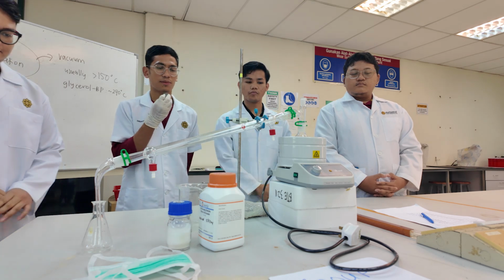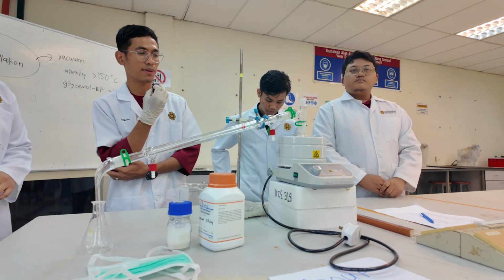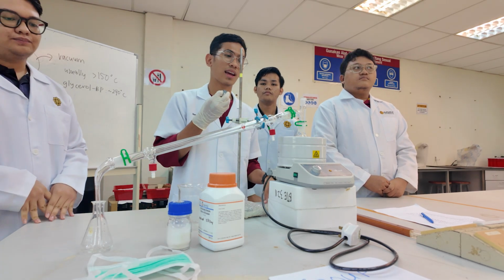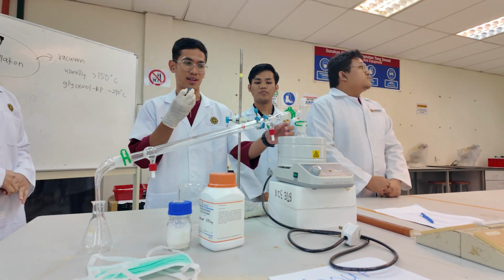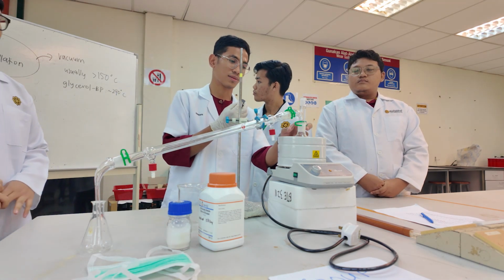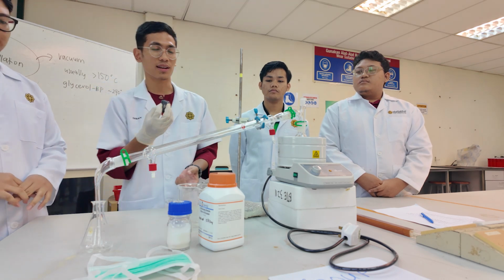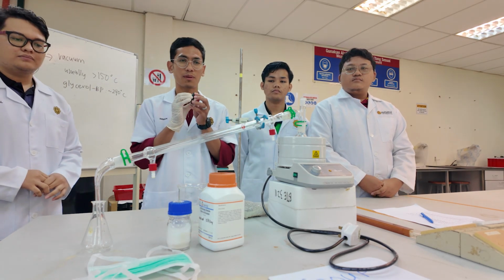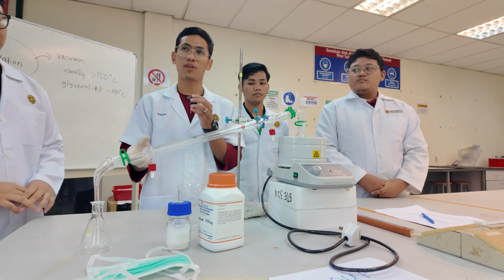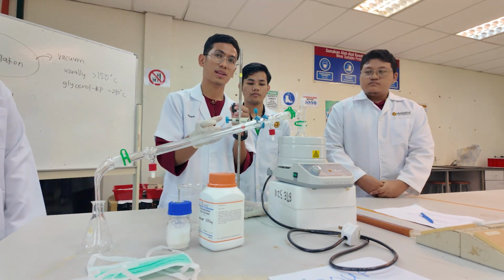For the second part, precaution and safety in the lab in this experiment is to prevent glassware accidents. In this experiment, we use a lot of glassware apparatus like the condenser, round bottom flask, funnel, flask and beaker, and we make sure we always use this glassware carefully when we set up and install the apparatus.